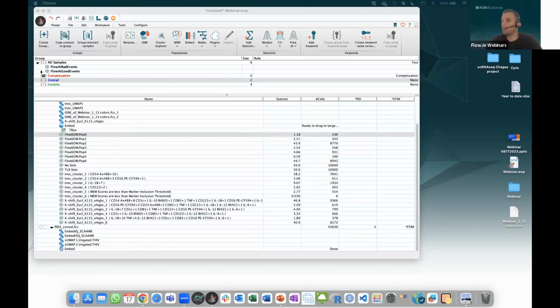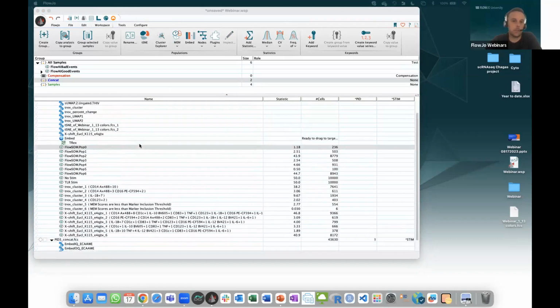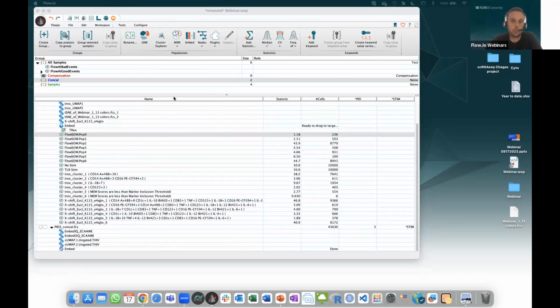All right, we are on the 1 hour benchmark. We're supposed to finish, so I think I'm going to wrap up here. Happy to answer any question if you have any left. But basically, that was the step after just doing your dimensional reduction and clustering algorithm.